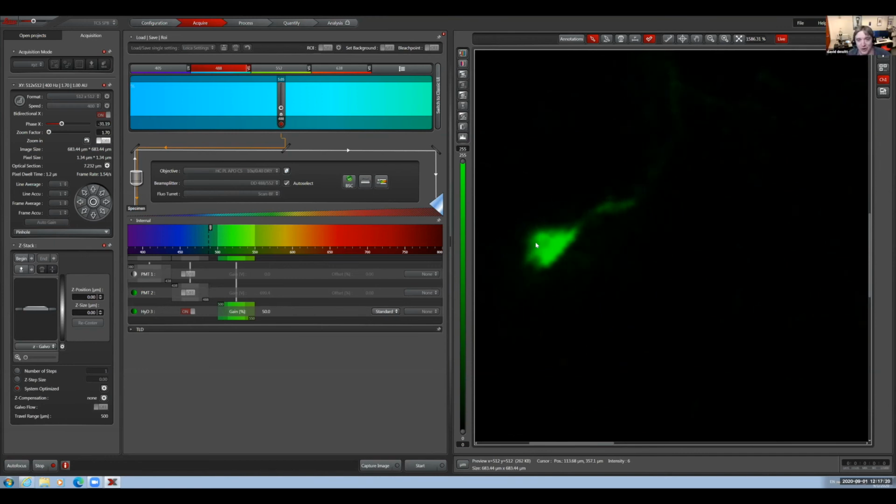It's a calibration that the service engineers do. But if there are big temperature swings, or if you zoom in a whole lot, there are some things that can make it not stay perfect. I'd say 99% of the time, it's not something you have to worry about at all. But if you ever see that zigzag pattern along the edge, just be aware that that may be what it is.